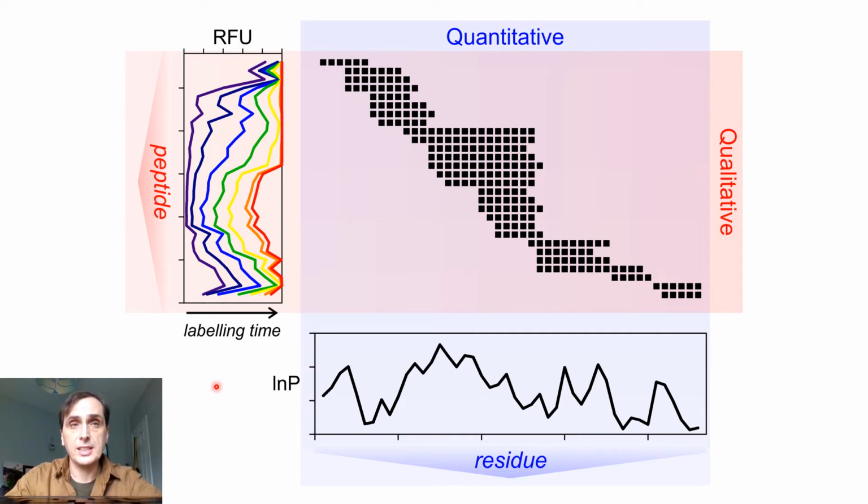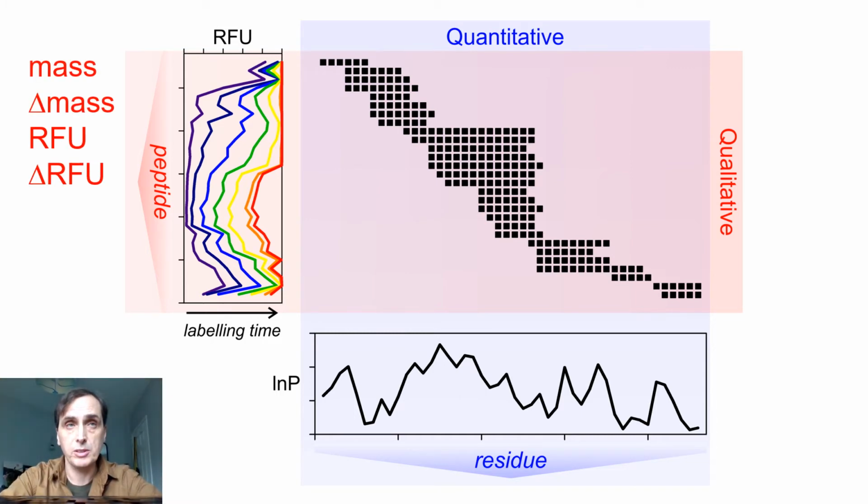I'm not going to tell users how to do their own experiments. Obviously there's many people who have had a lot of success working with HDXMS on the peptide level. The problem, for me, is that the metrics that we obtain when we characterize protein conformations at the peptide level are meaningless.